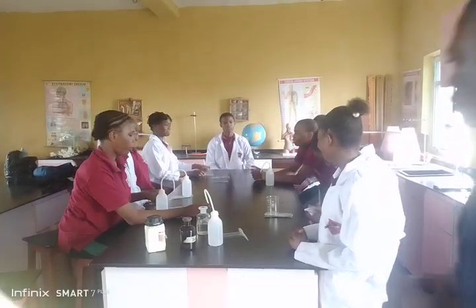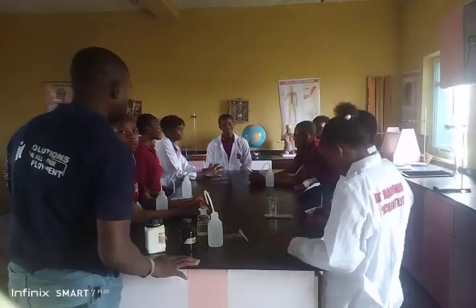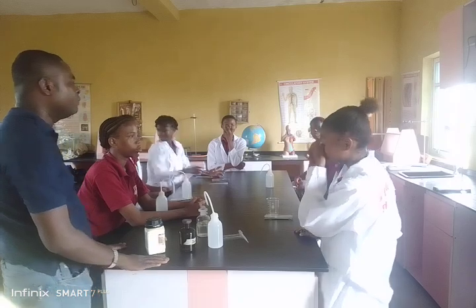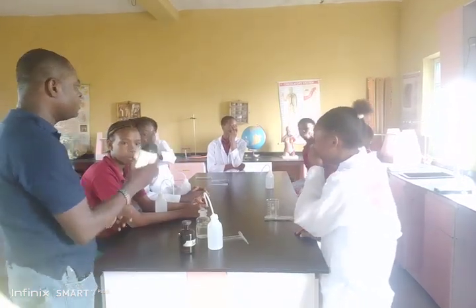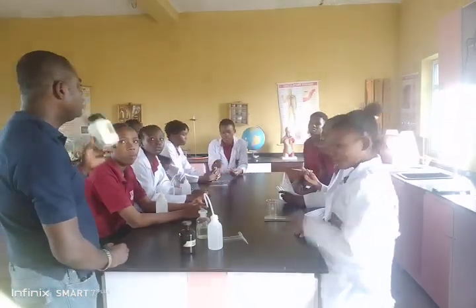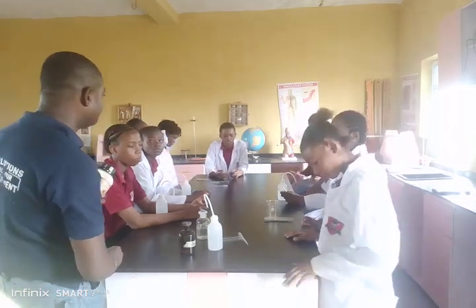Yes, what we are doing today, we want to test for copper 2 ion, and then we want to test for chloride ion. And this salt before us here is copper 2 chloride. Inside copper 2 chloride we have copper 2 ion and we have chloride ion.